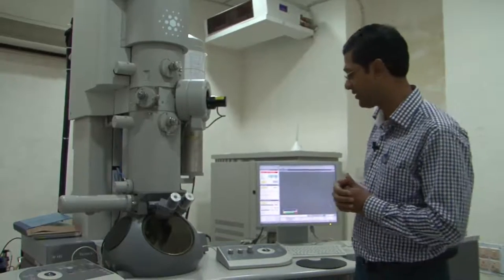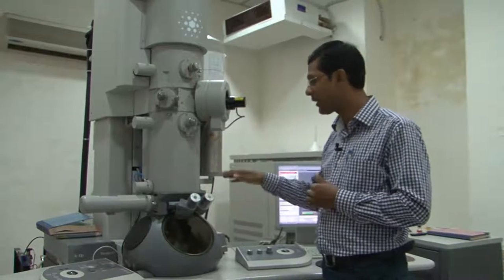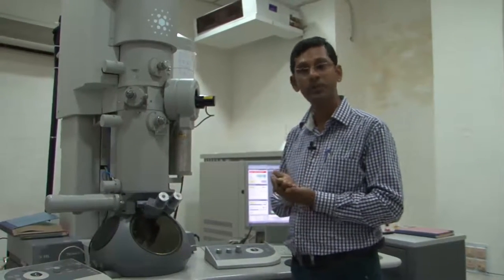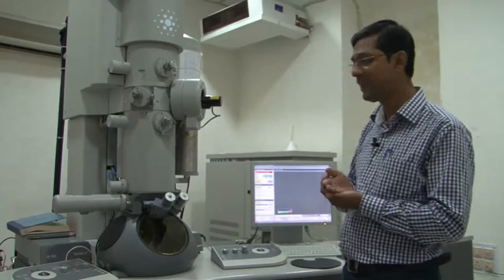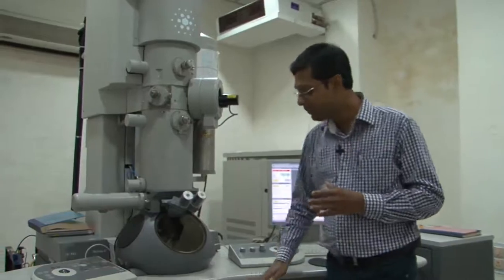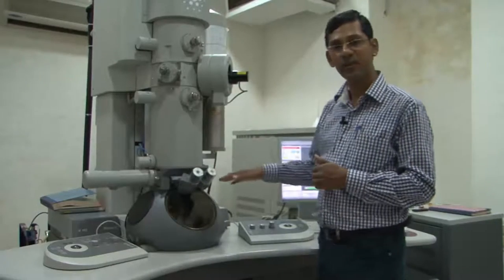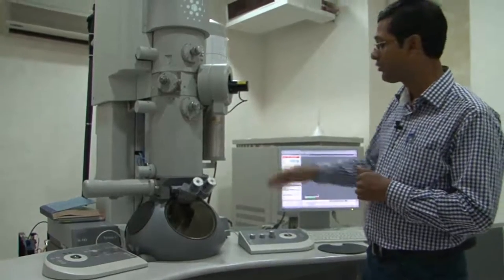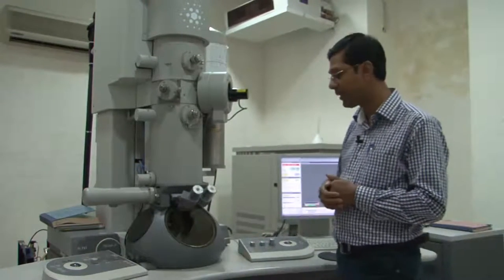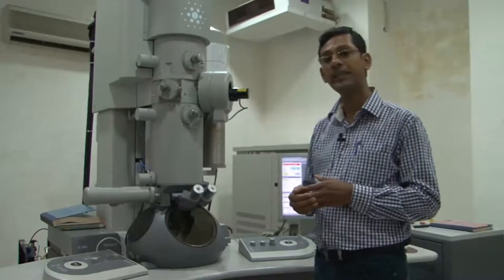Now, as far as the recording is concerned, because images need to be recorded, or whatever you are viewing on the screen needs to be recorded. In earlier days, people used to record using photographic plates, just like normal photographic plates. But these plates are very big and long, so they can be pushed just below the viewing screen. And because the transmission electron microscope has a very large depth of field, whatever is focused on the screen can be assumed to be focused on the photographic plate. And once these photographic plates are exposed by the electron beam, they can just be developed and the images can be obtained.